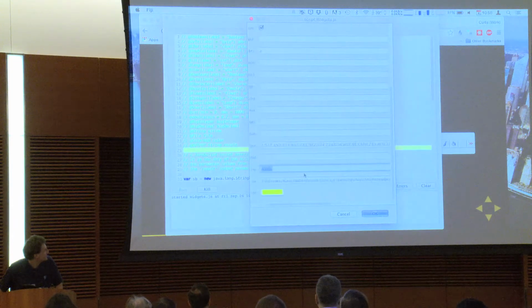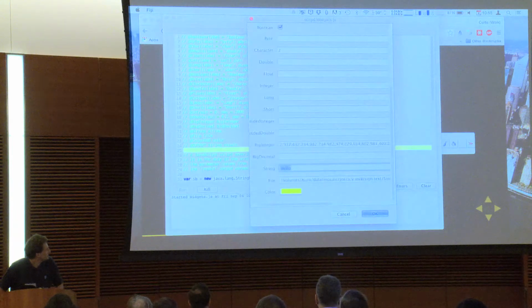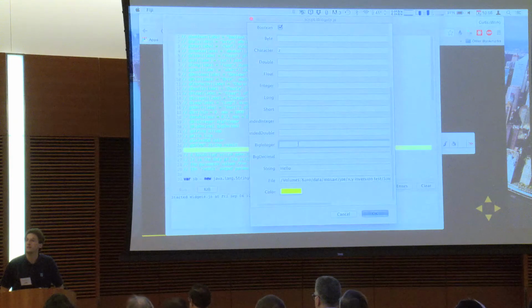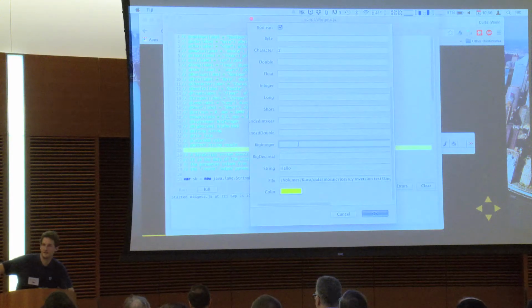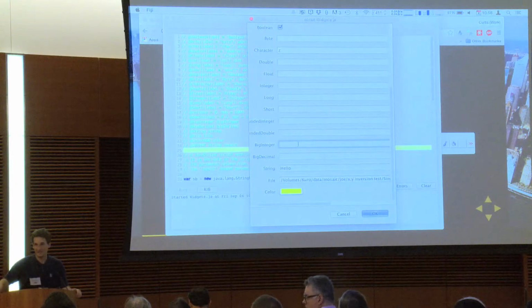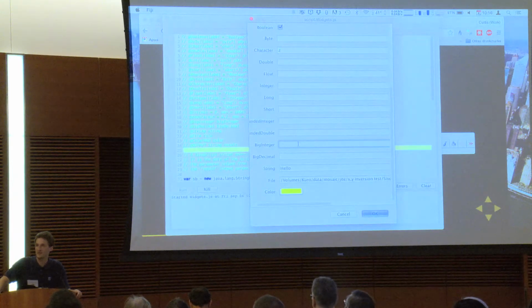I just want to briefly mention the other things that we do support, which are, wow, this is kind of long now because I typed a massive number. Is there a way to tell it to ignore a parameter if you don't bother with anything? It keeps telling you that it wants more. Yes, okay. I knew that would come up because when we were walking through this workshop, we ran into that as well. So that is a feature, not a bug.